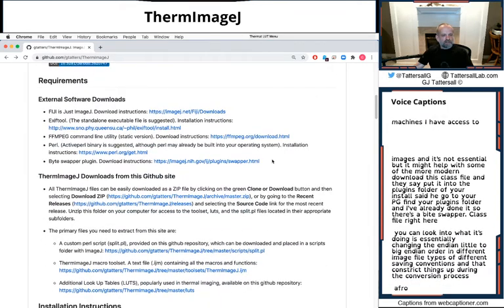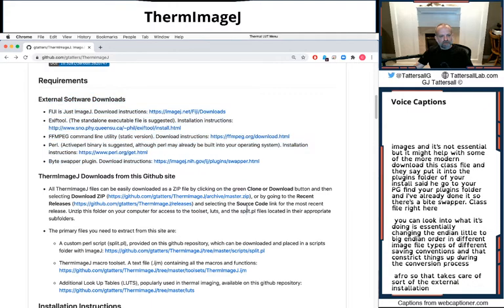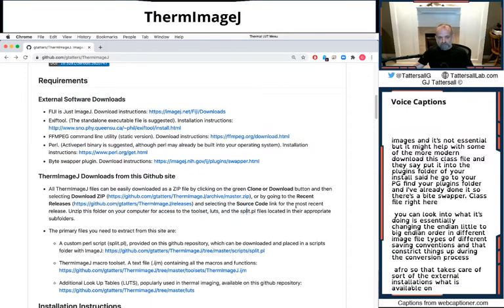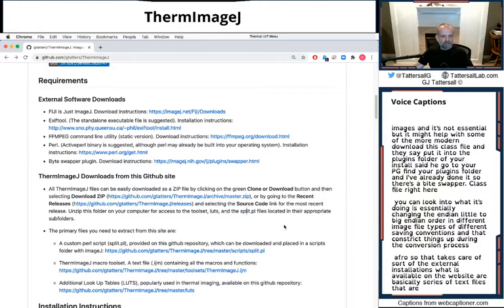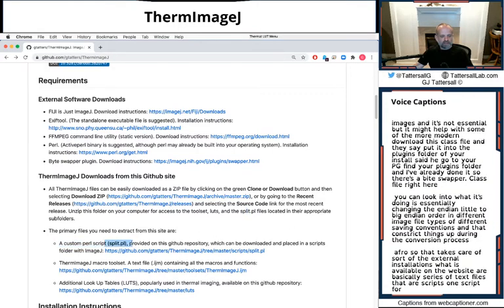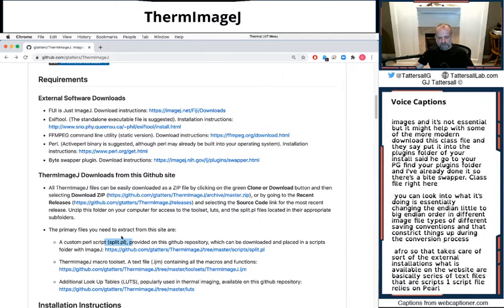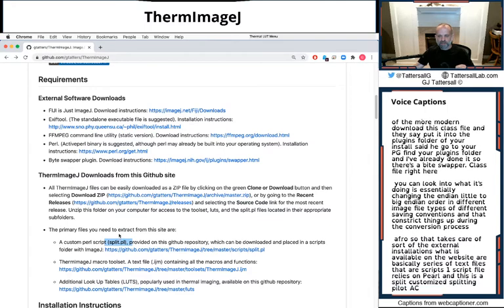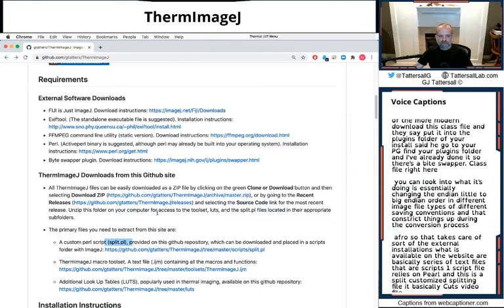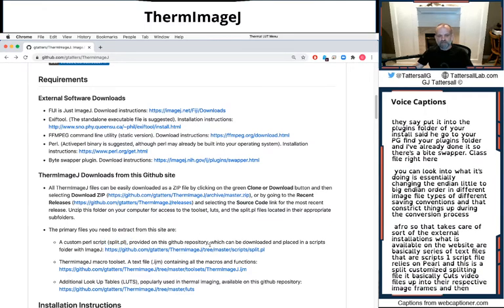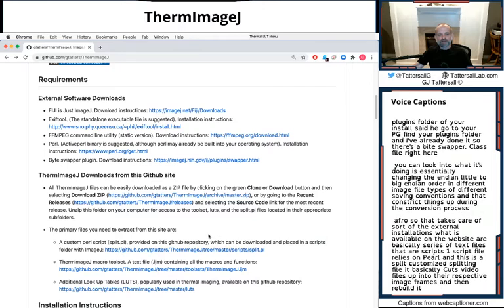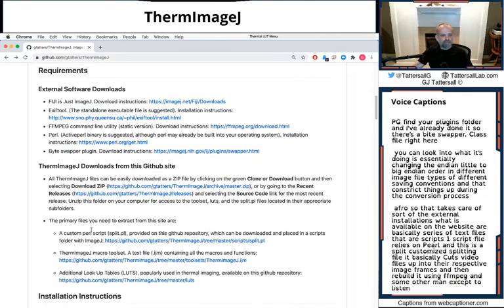So that takes care of the external installations. What is available on the GitHub site are basically a series of text files that are scripts. One script file relies on Perl, and this is a customized splitting file. It basically cuts the video files up into their respective image frames and then rebuilds it using FFmpeg and some other EXIF tool at the same time.